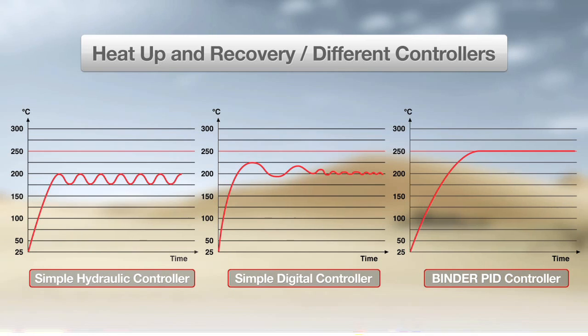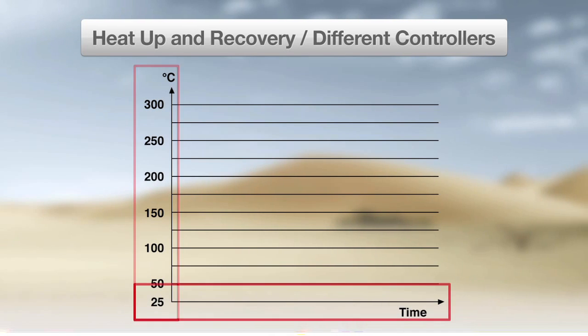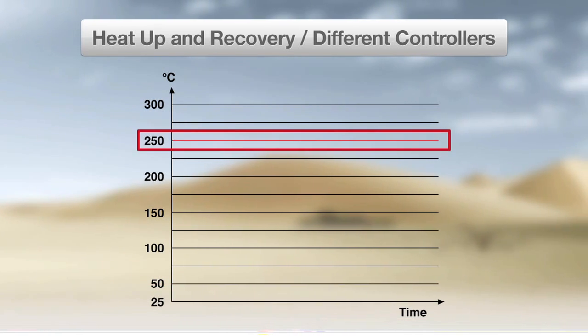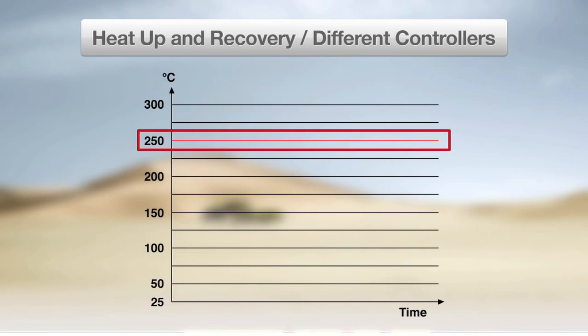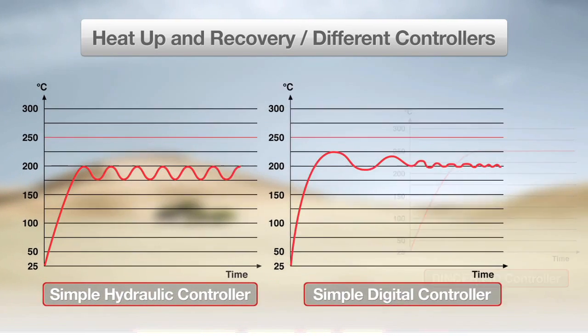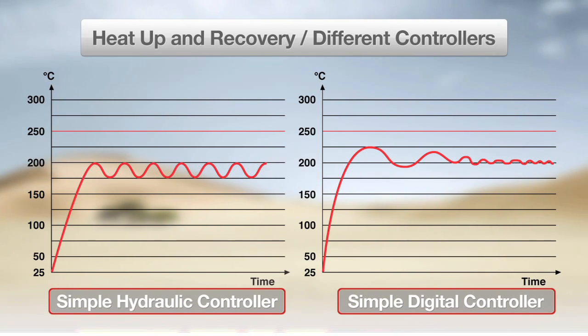Here you can see three graphs comparing heat-up and recovery of three different ovens. Temperature is shown on the Y-axis and time is shown on the X-axis. The set temperature point is 250 degrees Celsius as indicated by the straight red horizontal line. For the ovens with simple hydraulic and digital controllers, you can see that while the time to heat up is relatively fast, neither oven accurately reaches the set temperature and the uniformity after heat-up is low.